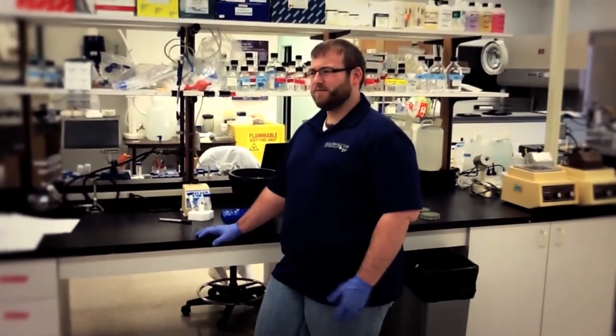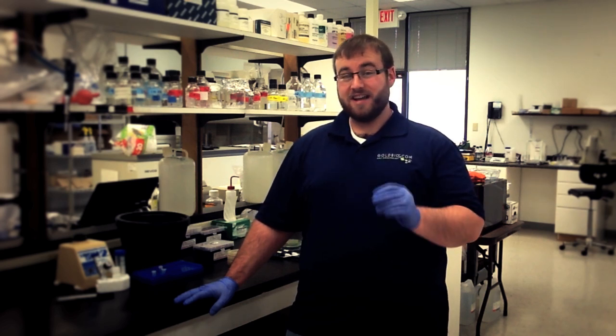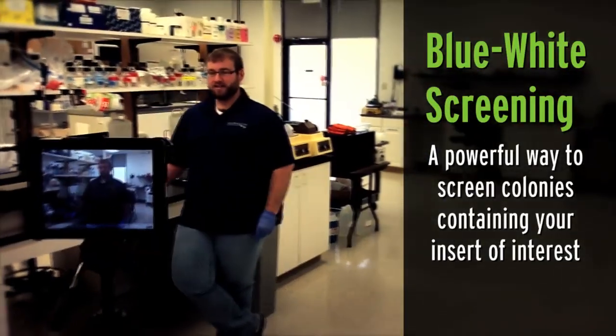Even though it was first done in 1973, restriction enzyme digestion and ligation of DNA into a plasmid vector still has a prominent place in today's molecular biology lab. Unfortunately, even though it's been around for a long time, it's not entirely foolproof. Today we're going to go over an easy, visual way to confirm that the bacteria you're using have been successfully transformed with a plasmid containing your specific insert. That's done with a technique called blue-white screening.